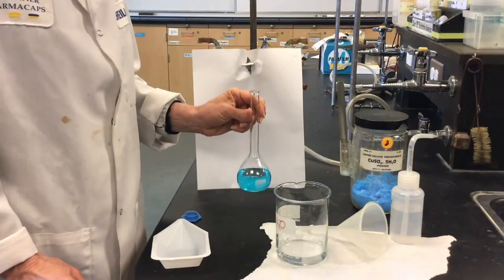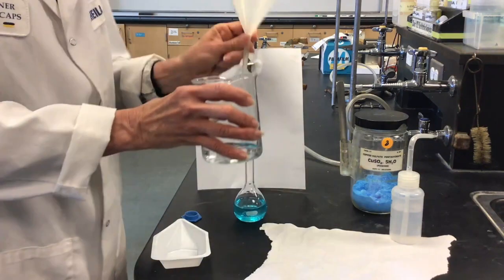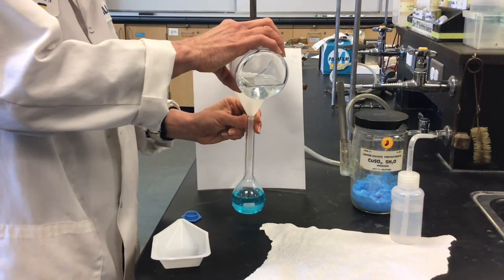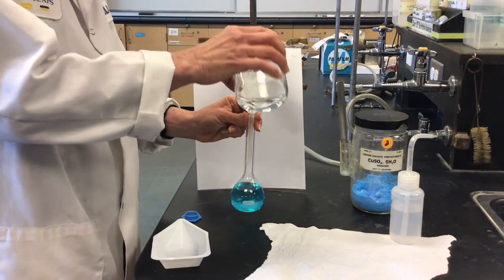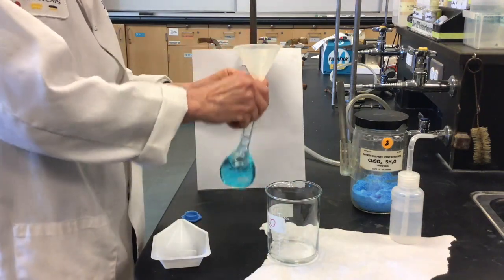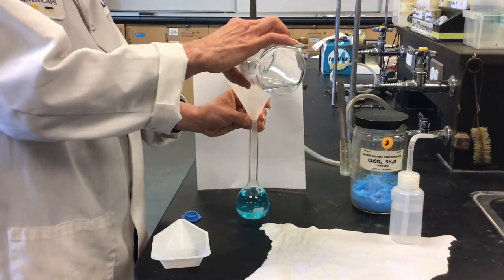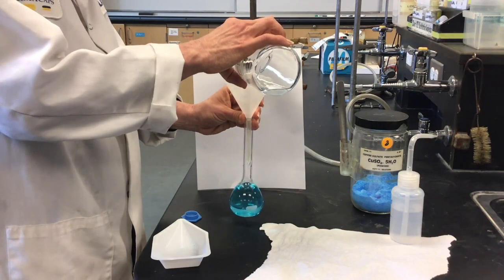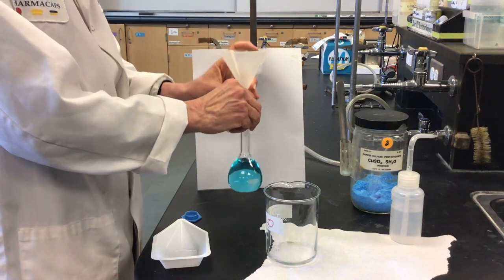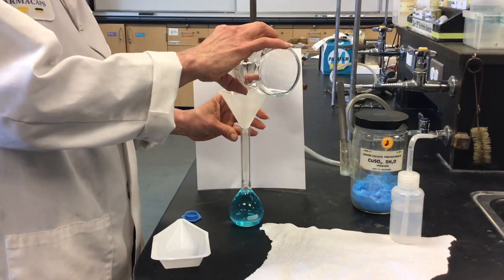So once the copper sulfate pentahydrate is dissolved, we can go ahead and add more water using our funnel, of course, because that makes it much easier so we don't spill. Fill it up a little bit more. Swirl our solution around while there's still space in there. Add some more water. And then once you get into the neck, the skinny part of our flask, the water is going to appear to be adding much quicker as you go up.